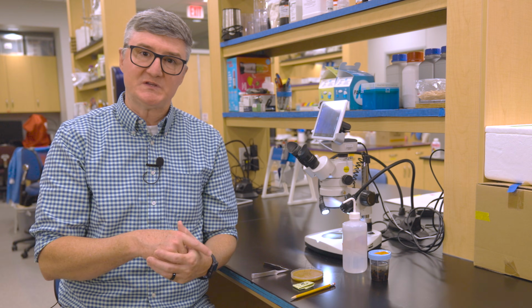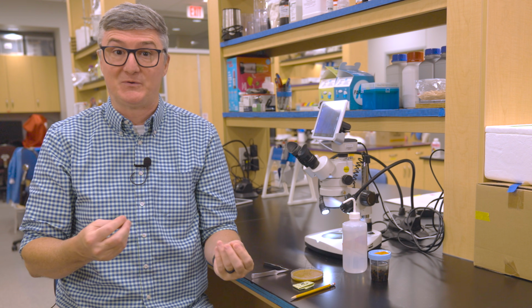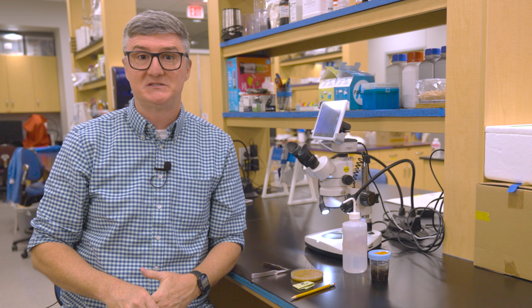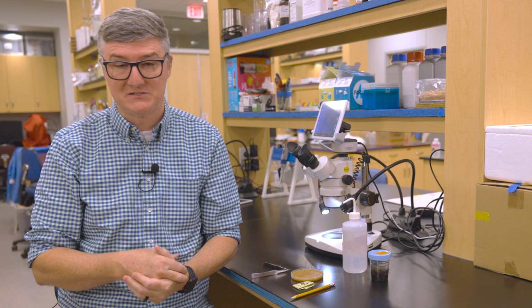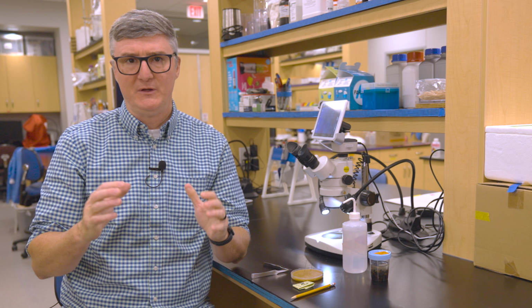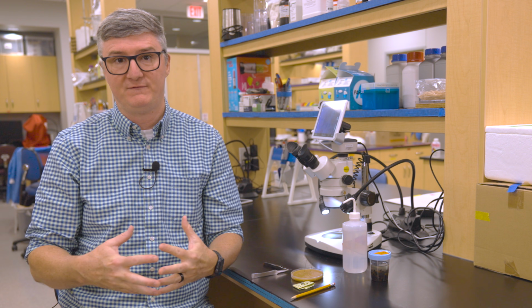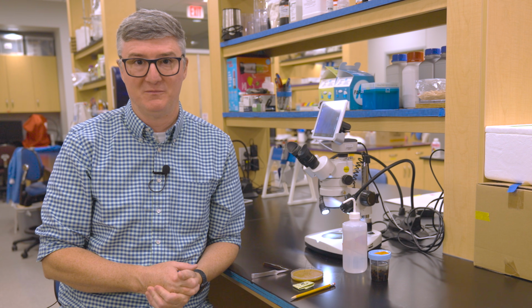You want to use this process on 10 to 20 bees so that you can get an estimate of the percent infestation. In other words, if one bee is positive out of 10 bees, then it's a 10% infestation rate. If one bee is positive out of 20 bees, it's a 5% infestation rate. But usually 10 to 20 bees are sufficient to give you an indication of a rough infestation rate and help you know if your colony is suffering from tracheal mites.